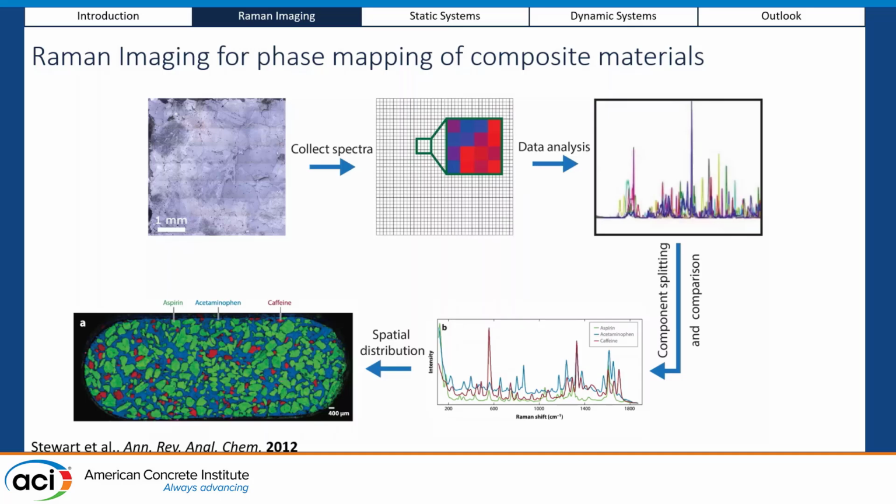Yes, so it's actually Excedrin. So this is, you can say, pain medicine. It has caffeine, Tylenol, and aspirin, and you can not only quantify how much of it is present, but you can see how they're spatially distributed.